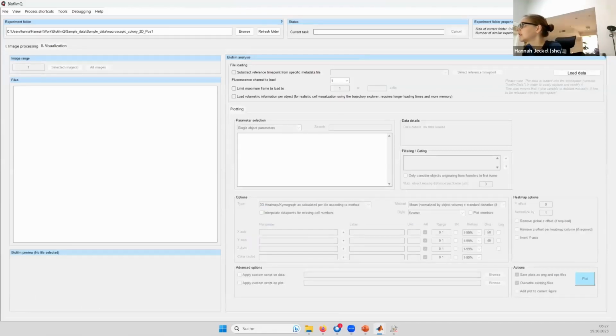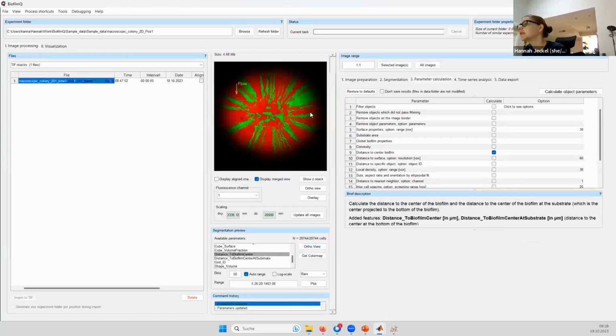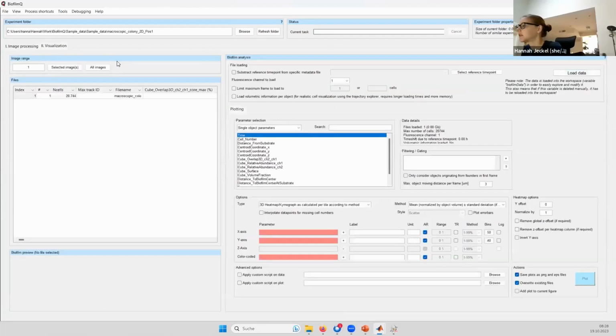And moving here, let's see if we can load the data. Again, this should be relatively fast because we have a two-dimensional data set. It's not very large. And now the first thing that I want to ask essentially as a question of my experiment is, if I move from inside to outside and I look at the relative abundance in this, let's say ring going outside, is it going to change and how is it going to change? How do I do that?